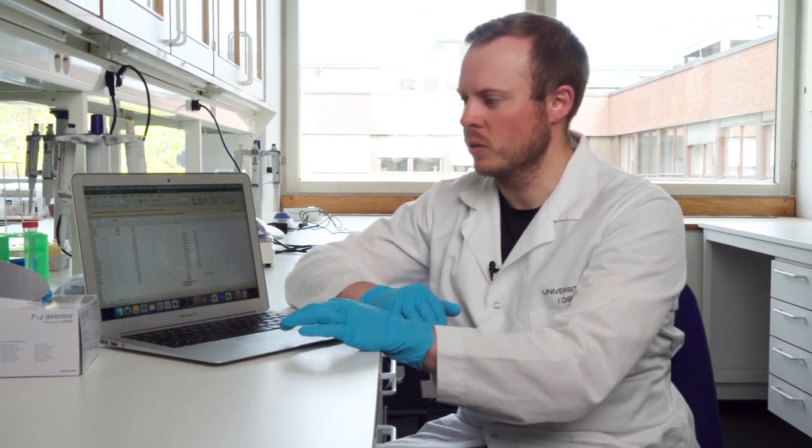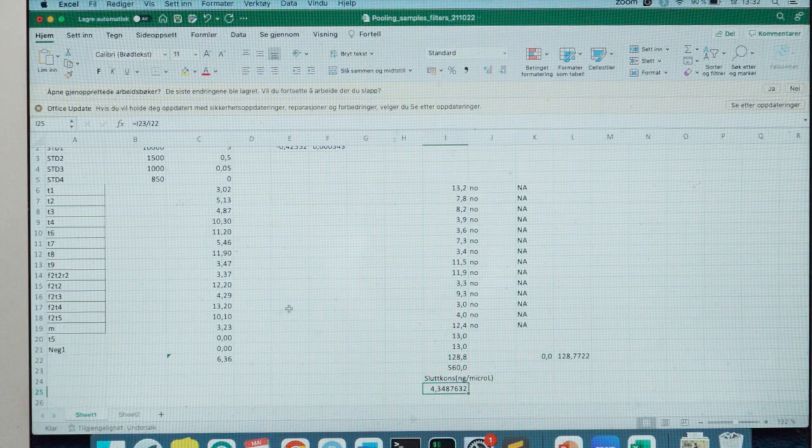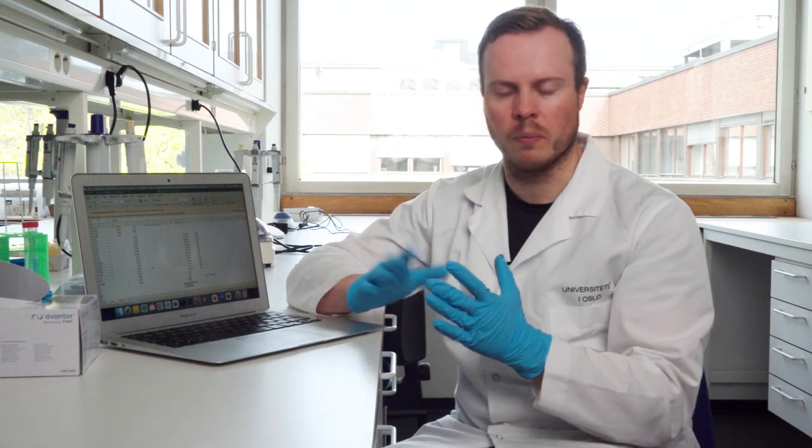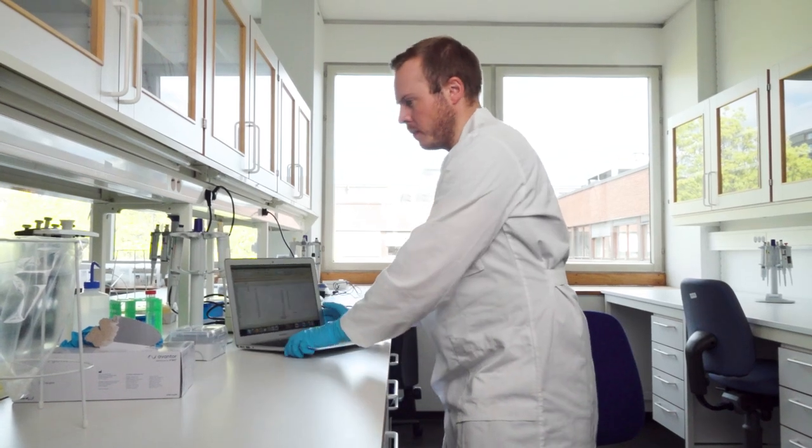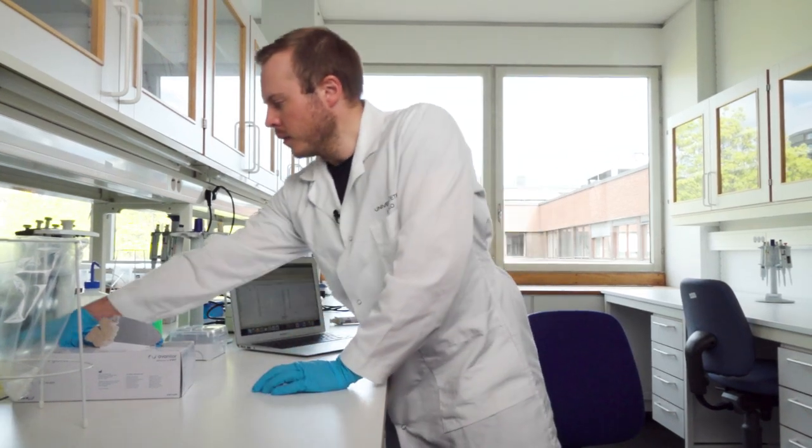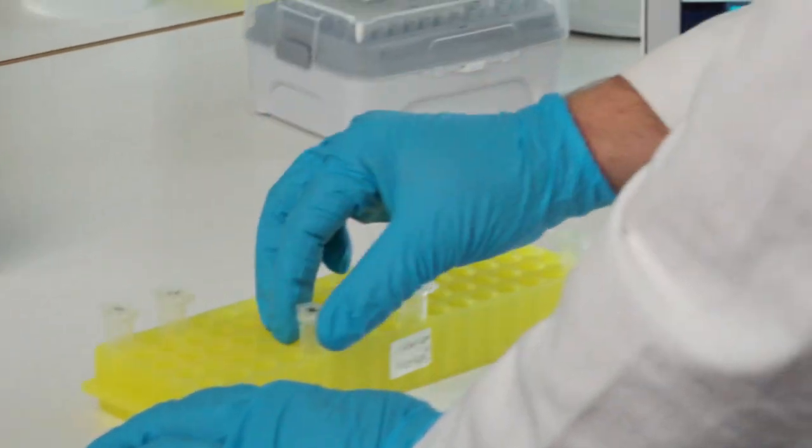Okay, so now we have done the calculations from the PicoGreen. So we are now ready to pool them. And how I like to do this is that I place my computer here.